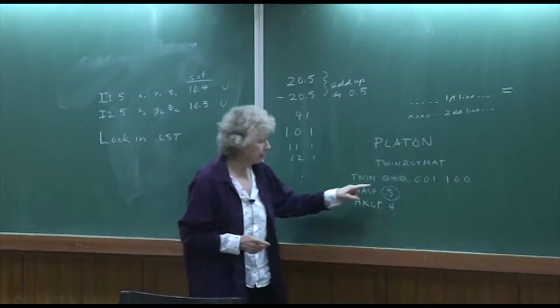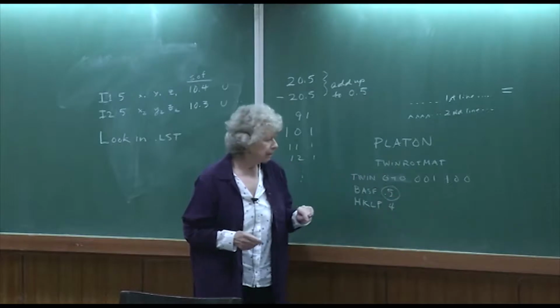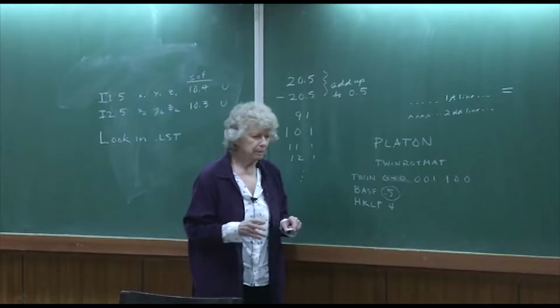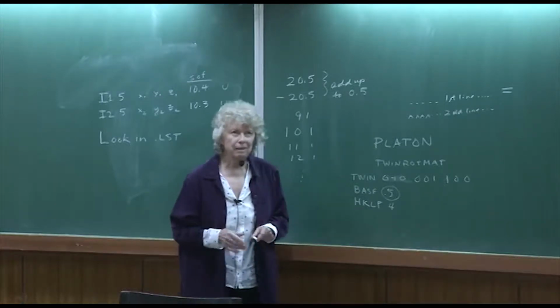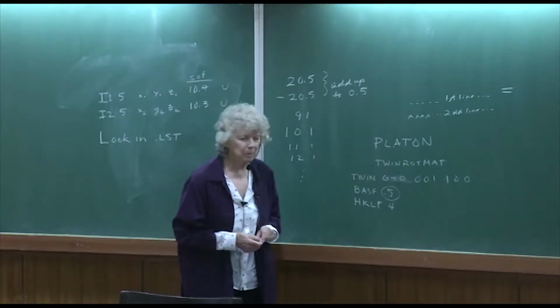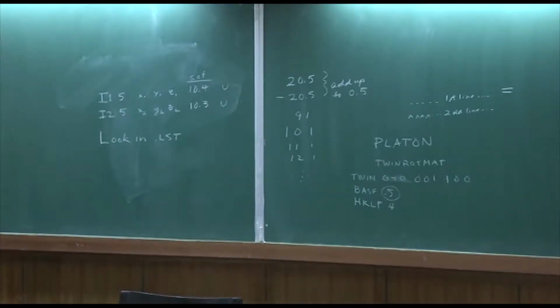To retain the right-handed coordinate system, if two of these change sign, then it's going to change the handedness. So you will see there will be an error message, and then you realize you need to add another negative sign. Don't worry about it. It's obvious when you need to do that, because you're switching to left-handed instead of right-handed.